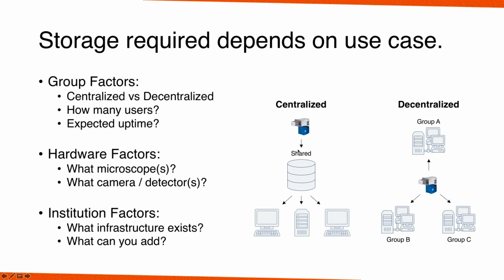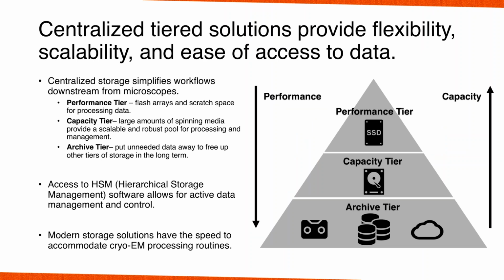Because no matter how your facility works, you don't want these connections to cause you downtime. Because as a facility manager or someone who is upkeeping the microscope, if this user's filled up their data and they go to collect and they can't collect because they filled up their storage, they're inevitably going to blame you. So it's great to help get all of this storage going. I'll speak to both of these setups because I think they're both equally important, because it's all perspective. First, we'll talk about centralized storage though.